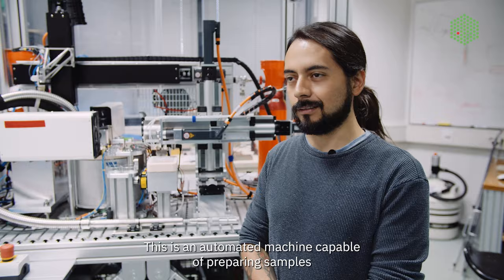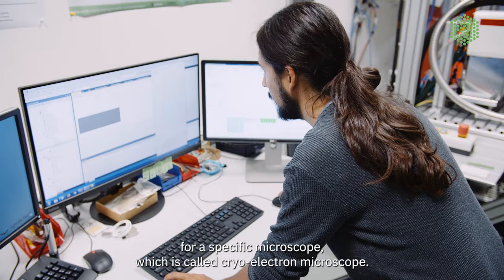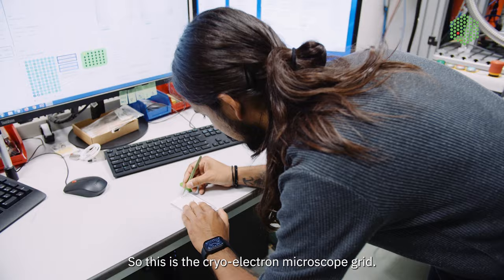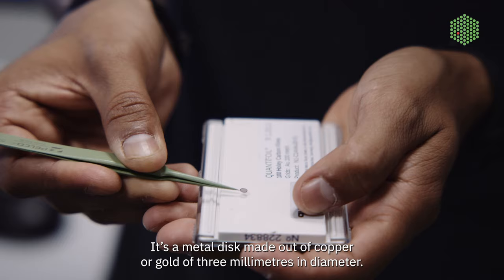This is one of our projects. This is an automated machine capable of preparing samples for a specific microscope, which is called cryo-electron microscope. So this is the cryo-electron microscope grid. This is what holds the sample. So it's a metal disc made out of copper or gold of three millimeters in diameter.